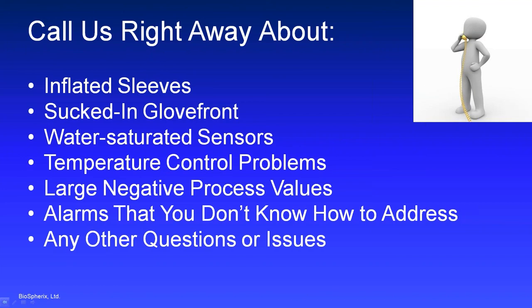If you come in and you see that the glove front is kind of sucked in and it looks like there's negative pressure inside the chamber, then call us right away. It could be something's going on with your pump, or well, we can help figure out exactly what's going on with the pressure in that chamber.